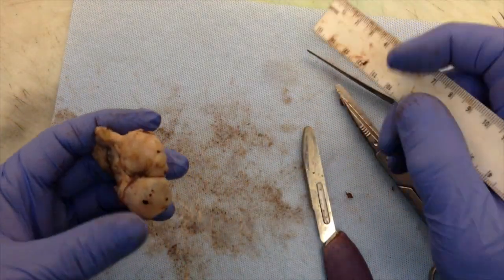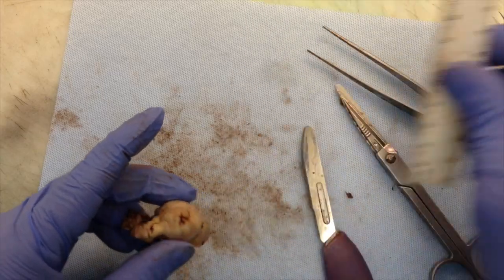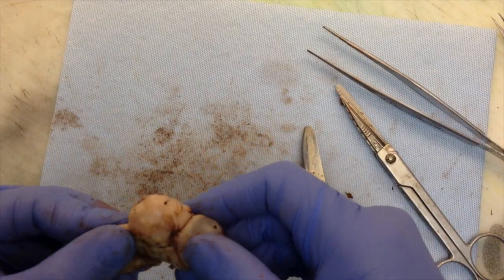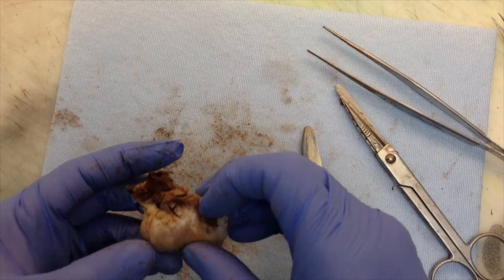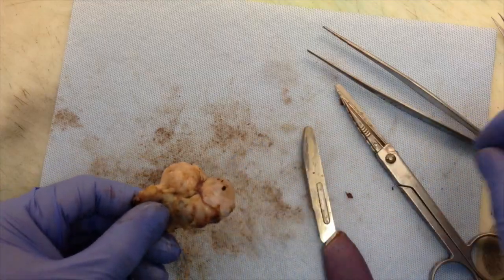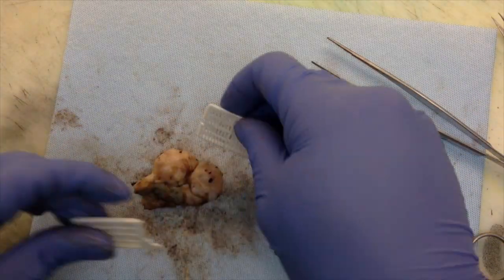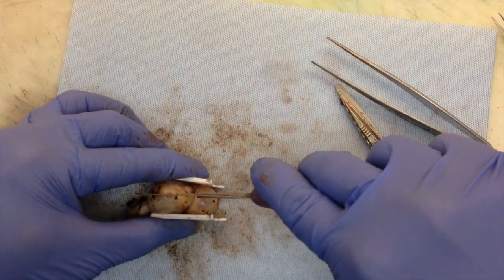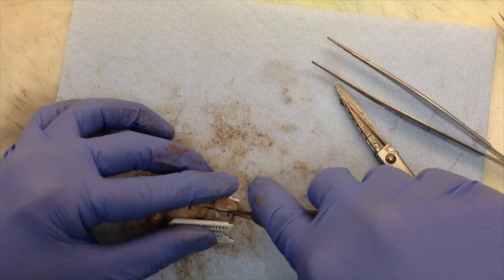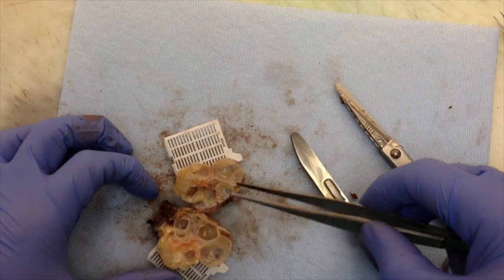The right ovary (15.6 grams, 3.8 by 2.7 by 1.8 cm) is tan and remarkable for multiple clear serous fluid-filled cysts. So there's multiple little cysts on the surface here. So the first thing I'm going to do is just cut it in half. Careful when cutting a cyst, it might squirt at you. So cut slowly. And so looks like a multi-loculated cyst, multiple cysts.